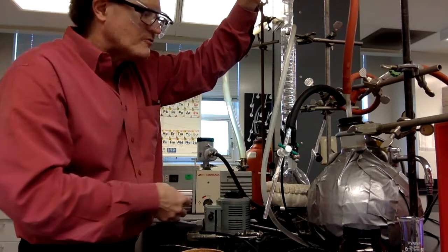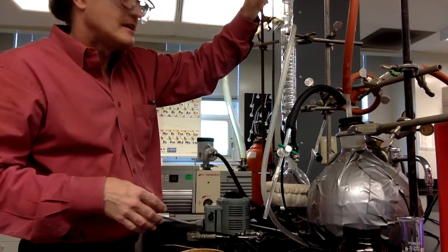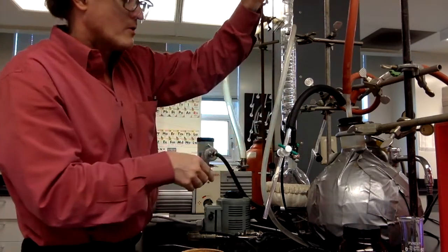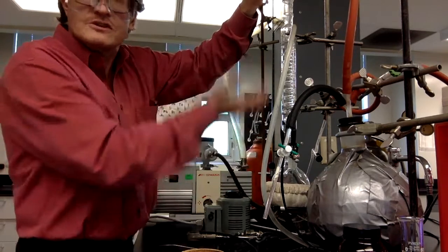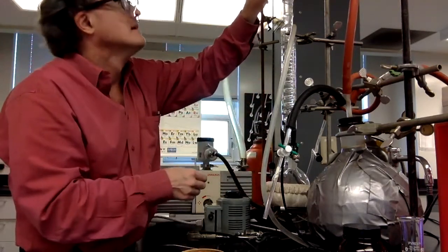We're getting dissolved gases out of here. We're getting the atmosphere out of there. We're trying to get this to be filled with just the vapor of our sample, which is the liquid. We don't want the boiling to be too violent so that it doesn't go shooting off up through the top there.